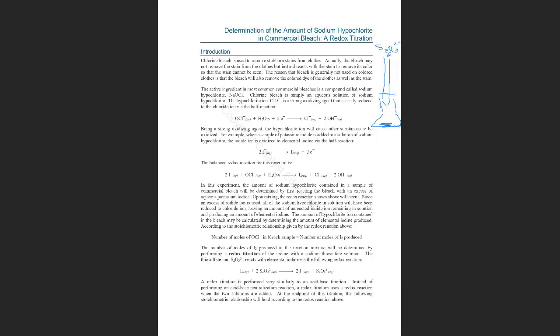This is what we are going to prepare here. We are going to add our titrant here until the end point.